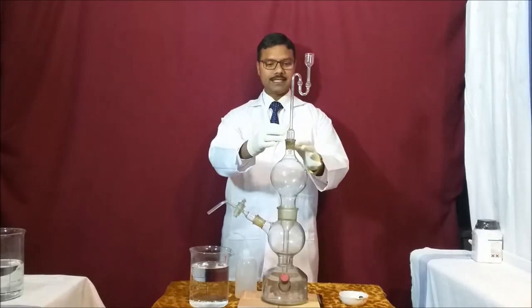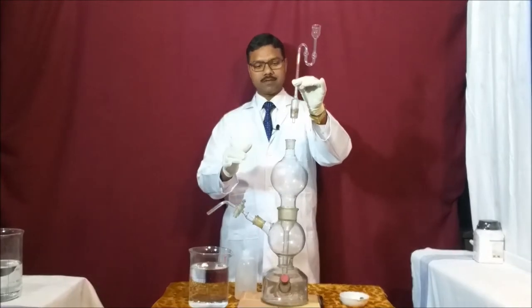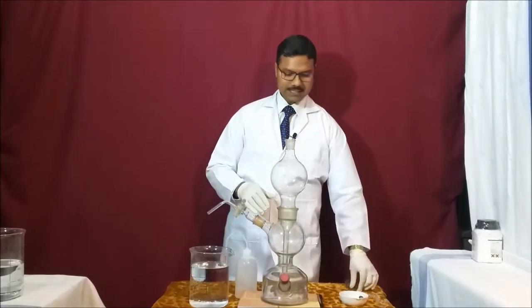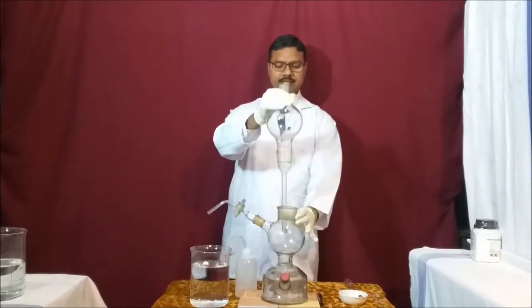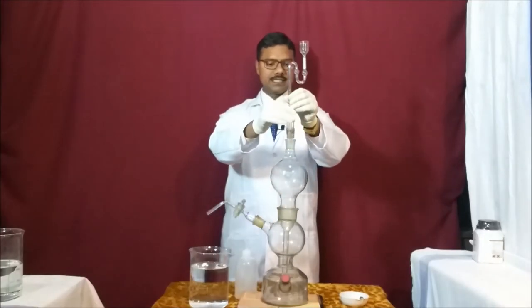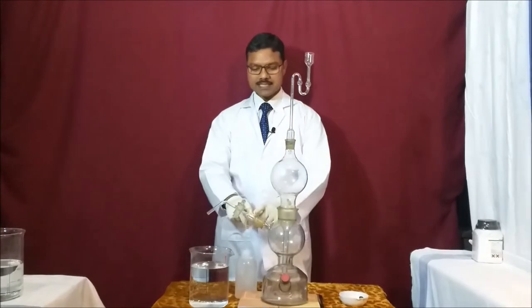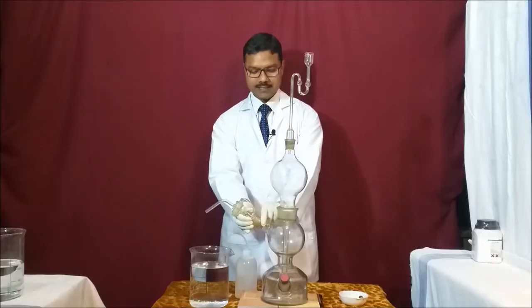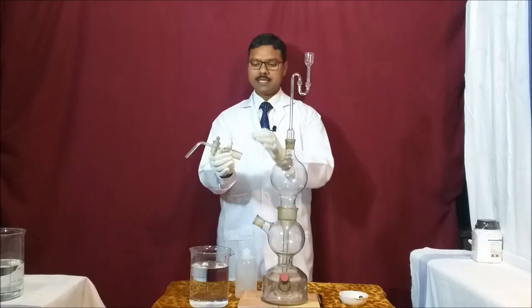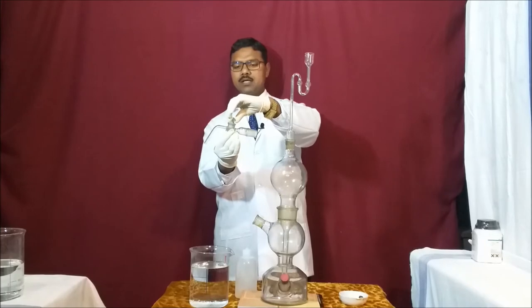If I disconnect and dismantle it, you can see this is the thistle funnel — we can take it out very easily. Section A is directly connected to section C with the help of this long tube. Now I am fixing the thistle funnel back into the apparatus. This is the connecting tube through which we take out the gas. This is the connecting portion with the knob — I can open it or close it.